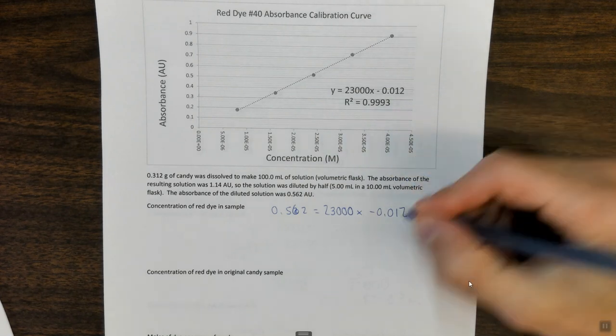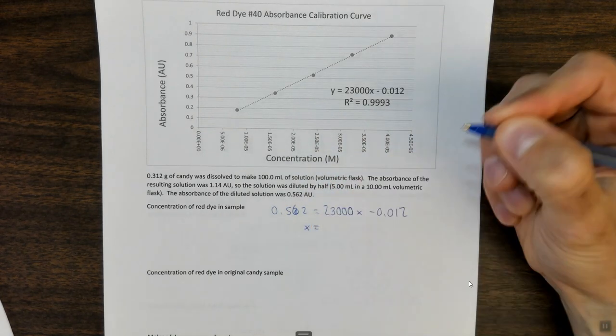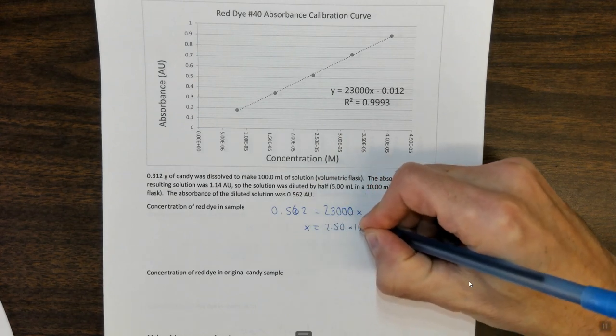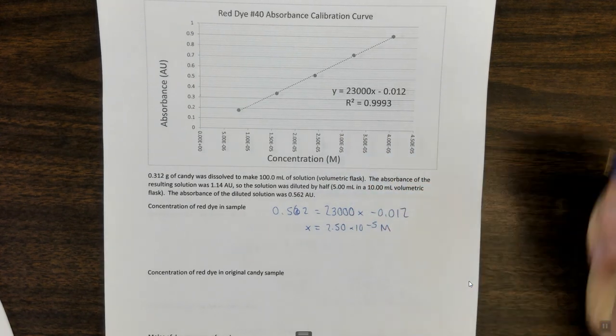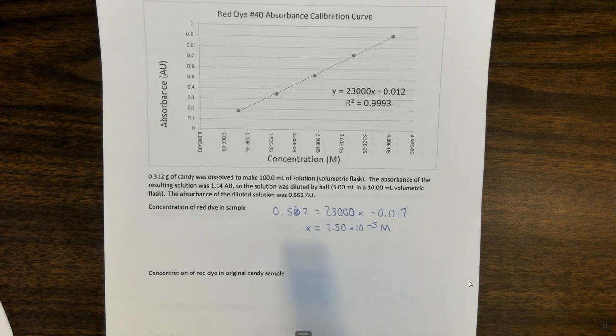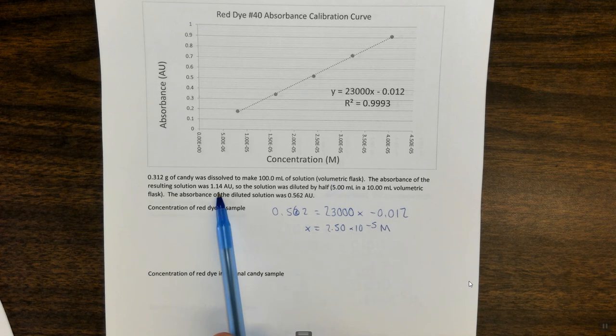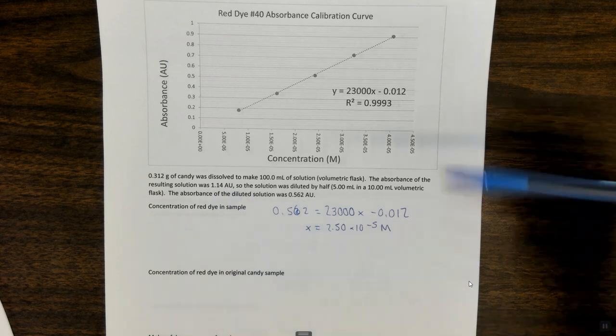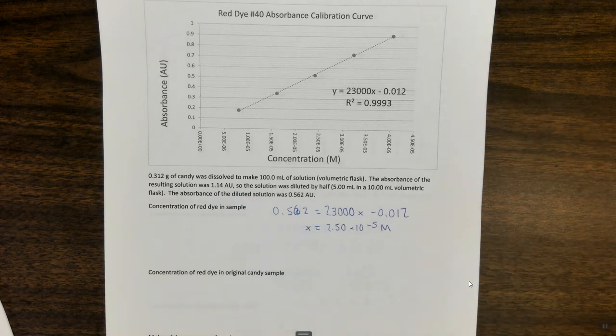When I do that and I solve for x, which I just showed you how to do a minute ago, I get 2.50 times 10 to the minus 5 molar. So that is the concentration of red food coloring in my diluted sample. After I crushed up some candy and put it into a 100 milliliter volumetric flask, I found the absorbance was too high, so I diluted it by half because it's close to the linear range. And you can see this is about half of that. And this is what I got as my concentration.